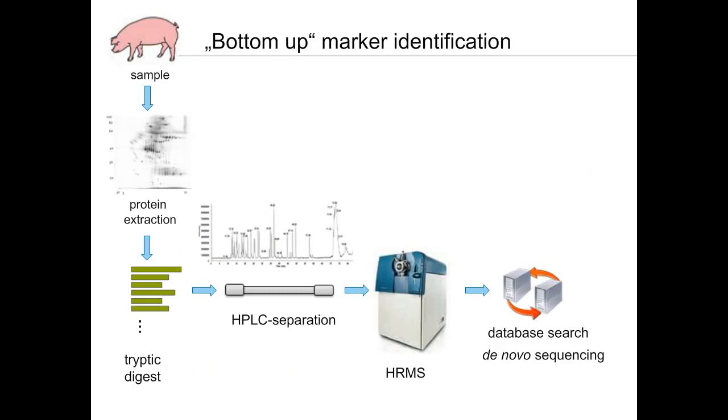One of the really major and most important points when it comes to experimental identification of peptide markers is that you have authentic material. You cannot just go to the supermarket and buy any samples. We tried this several times and also saw fraudulent material, so you really need to be careful to get authentic material.